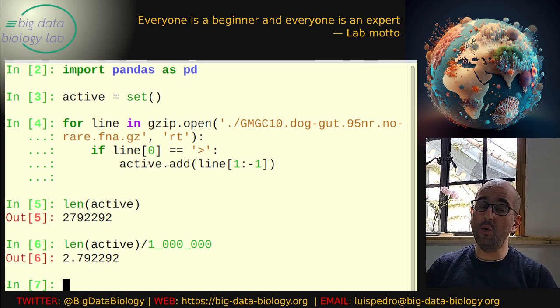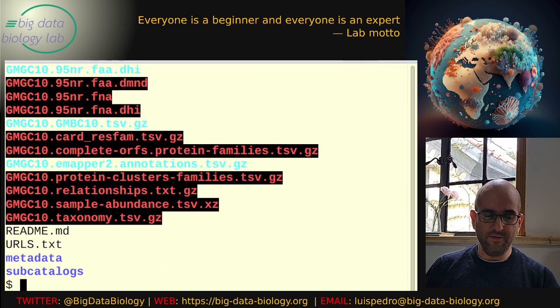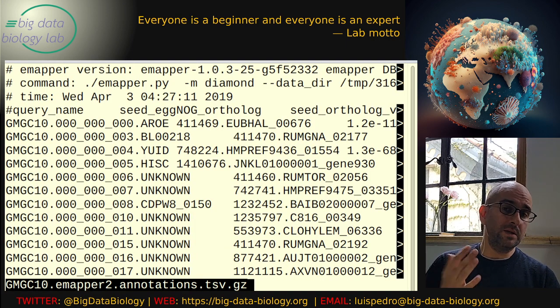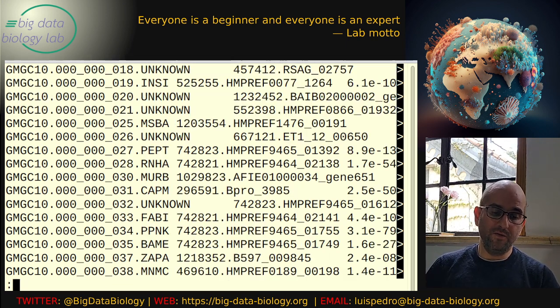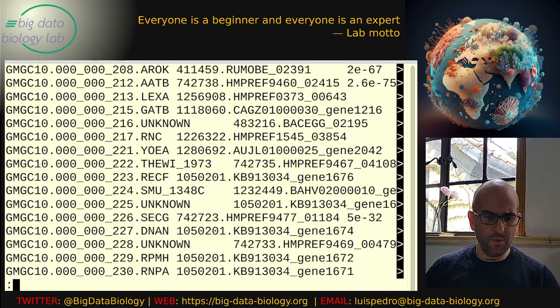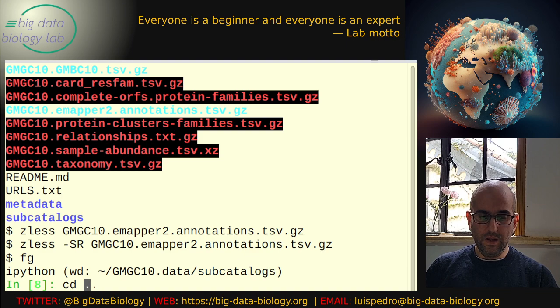Now if I look at the annotations available, there are annotations from eggNOG mapper 2. This is exactly what I was looking for — annotations for these genes. But the problem is that this file is very, very large. On my laptop I would not even be able to load it. So what I'm going to do is create a file that is a subset of this large file. Let's go back to Python.